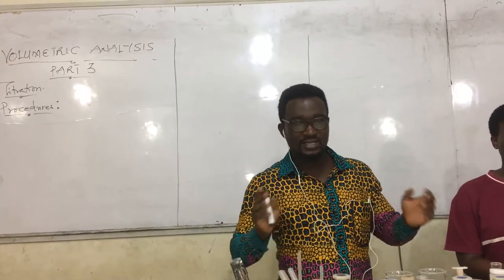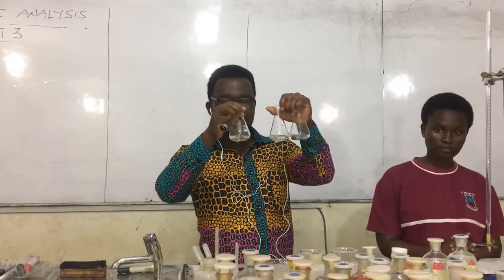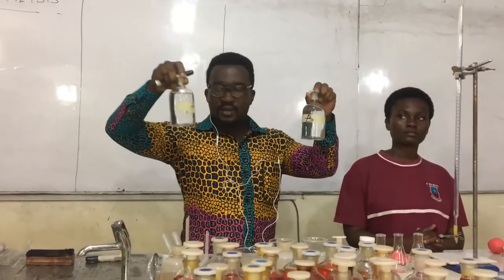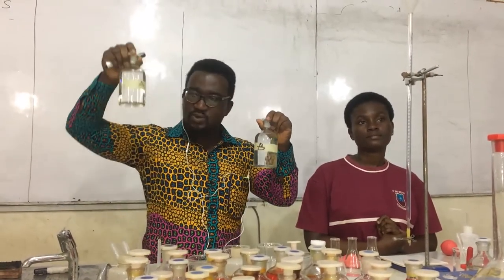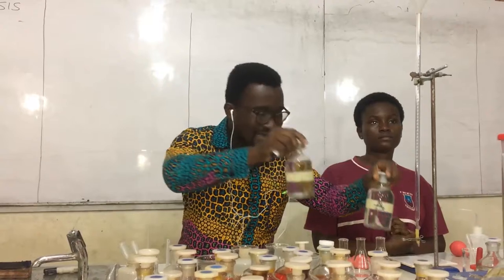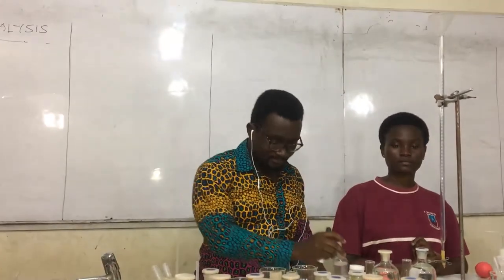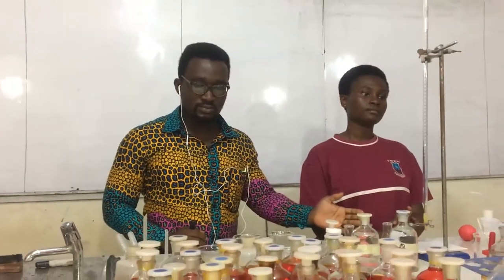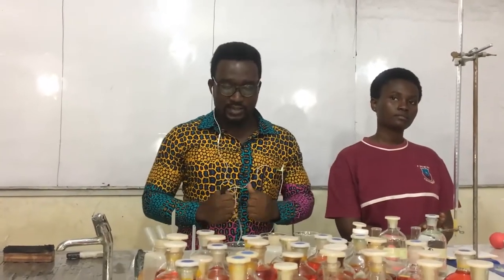Materials and apparatus needed. We will need 3 conical flasks, or 3 Erlenmeyer flasks. Also, we have our reagent bottles, 1 labeled A and 1 labeled B. This contains solution A, this contains solution B, as specified by our question. We also have our indicator, which is phenolphthalein. We have our burette mounted nicely, which has been rinsed 3 times with tap water, and then 3 times with deionized water.